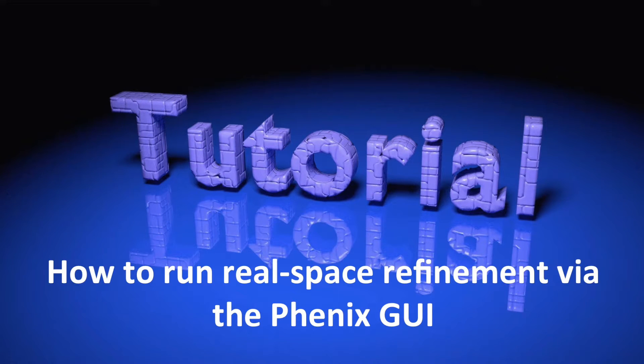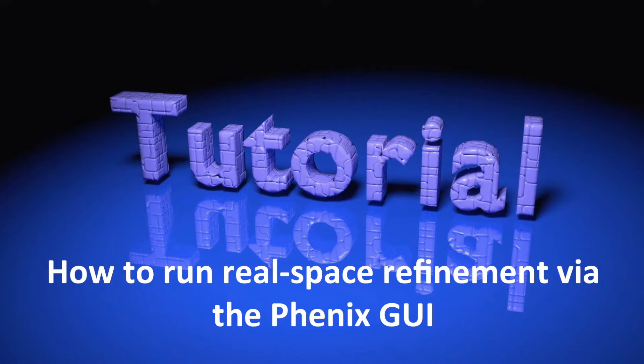Hi everybody! This tutorial is about running Phenix real_space_refine via the graphical user interface.